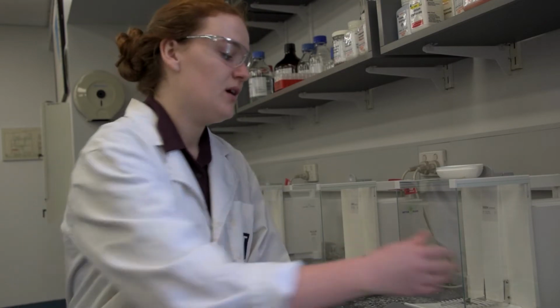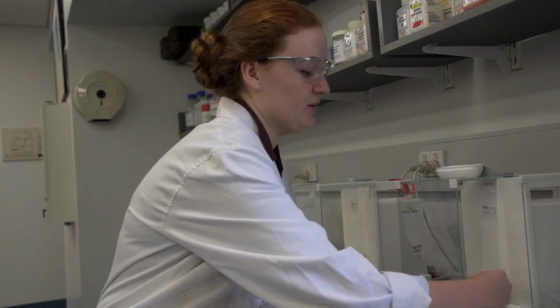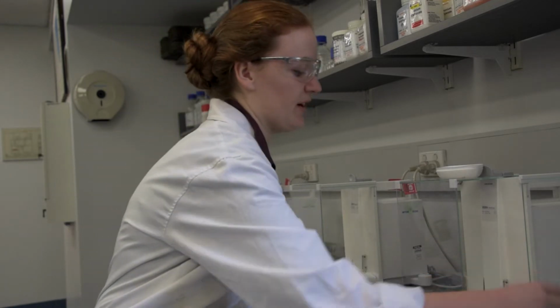In experiment 3, we have recorded the mass of our sample and our vial to be 4.7131 grams. We're now taking that vial with our sample and transferring it into our beaker that we're using, and then we can record the final mass of the empty vial without our sample to be 4.2151 grams.